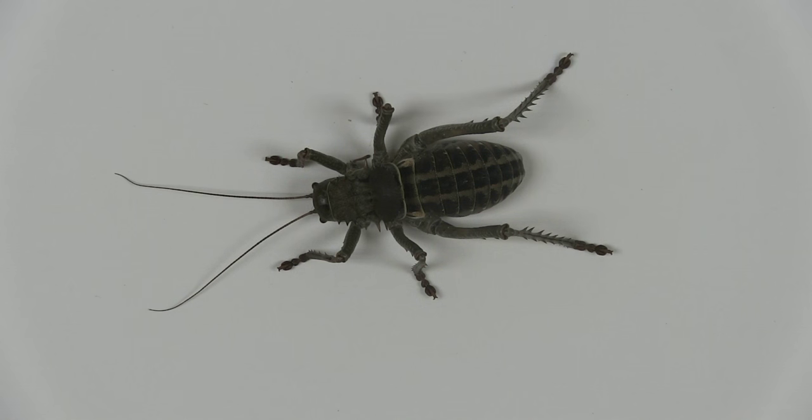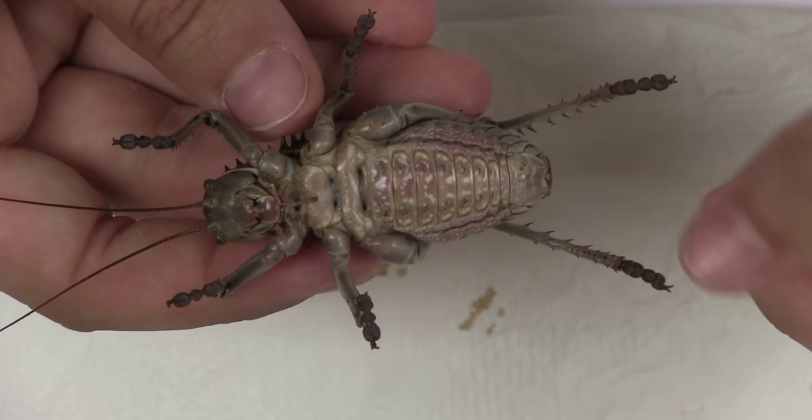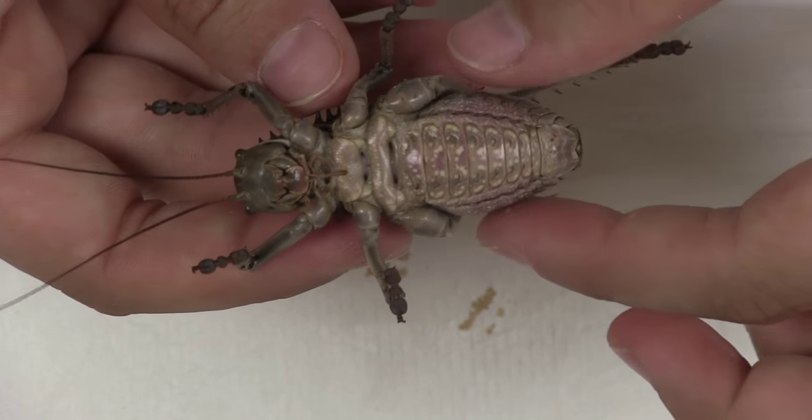Large insects, especially grasshoppers, crickets and katydids, will rot and grow fungi if they are not gutted and stuffed with cotton wool. The insect should be soft and flexible so that it doesn't break when pinned.